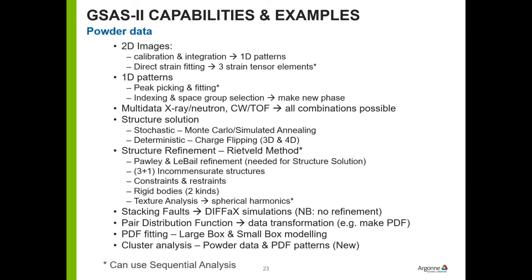Something which is brand new is the ability to do cluster analysis on powder diffraction data and on PDFs. So if you've got a lot of data and you want a real fast overview of what's going on, whether there are similarities between this data set and another data set, you can do the cluster analysis and that will show that to you, or at least that's the idea. This is new and under development.